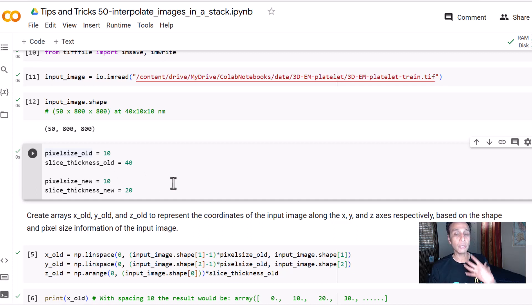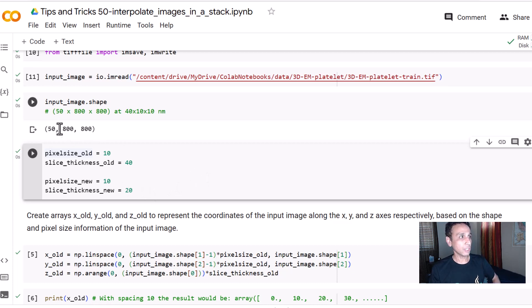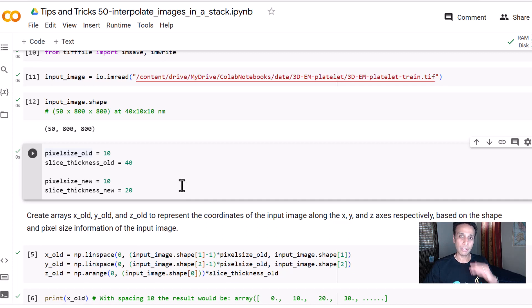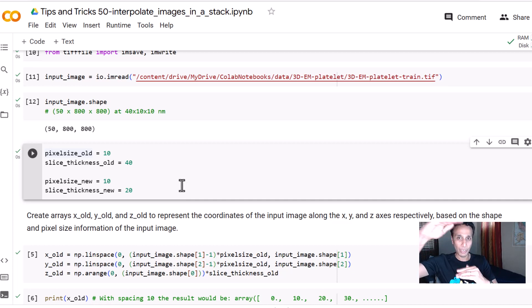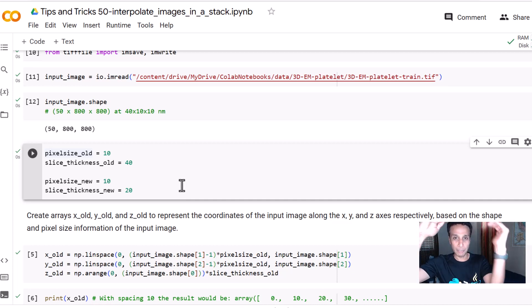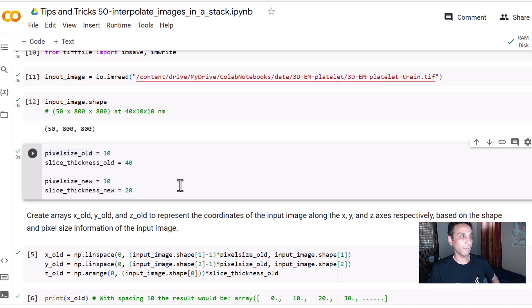The output volume will be a TIFF file with twice the number of slices. We start with 50 slices and will end up with 98 final slices — not 100 — because you remove the top and bottom and insert new slices in between, giving us 48 new ones.